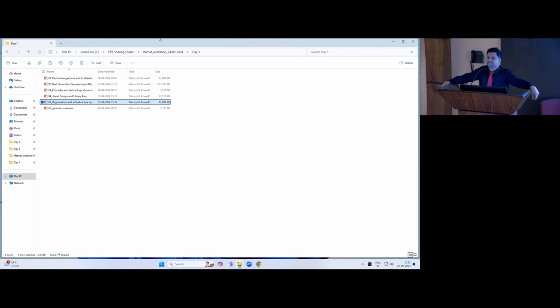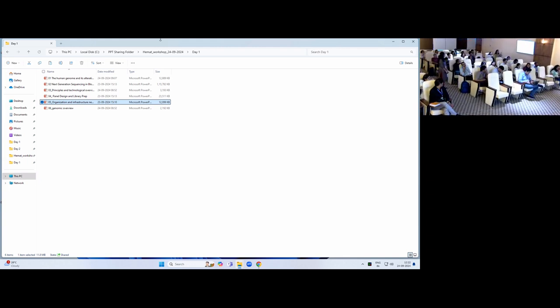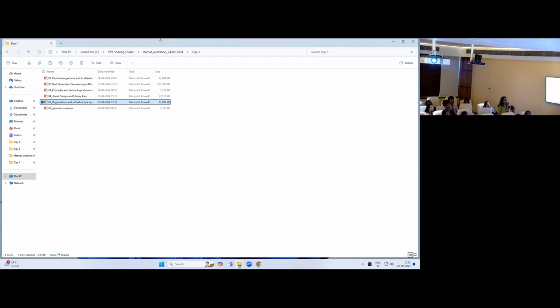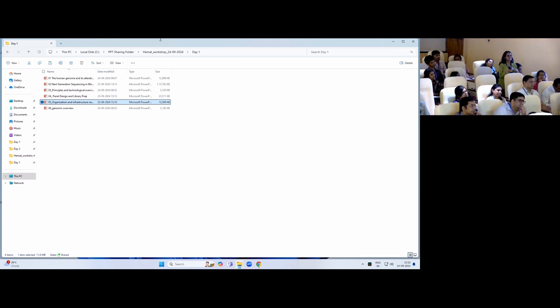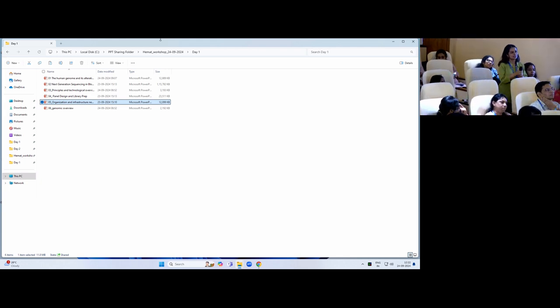Also, sometimes you are tagging some CNVs, like chromosome 5, 7, 8. So how are you doing that? Again, for that chromosome part, that is a separate design. I did not speak on CNV panel design. That is a separate consideration on how to do that altogether. But I can tell you, I wait for the lecture on the whole CNV topic, because there is a lot on how SNP arrays were done, and based on those SNP arrays, we have designed those chromosome backbones. So it is basically like that.